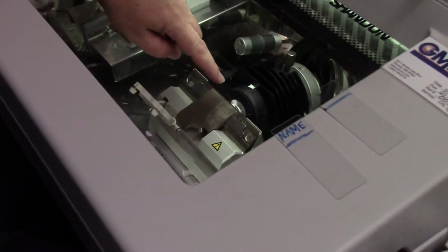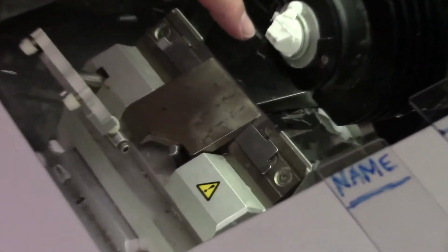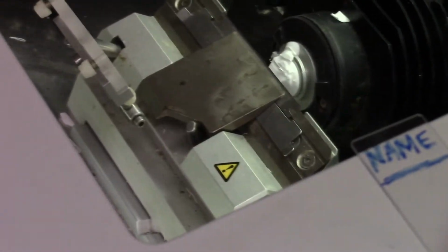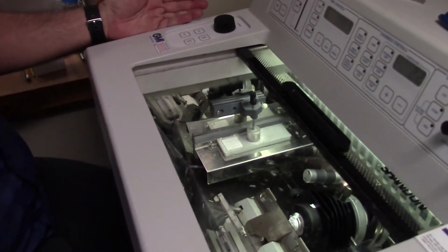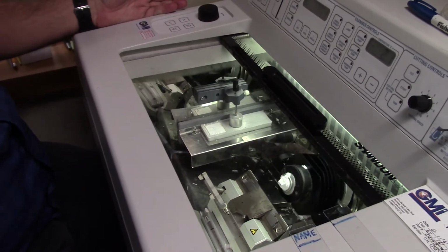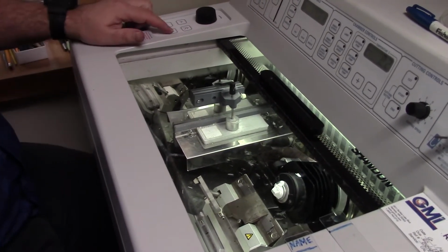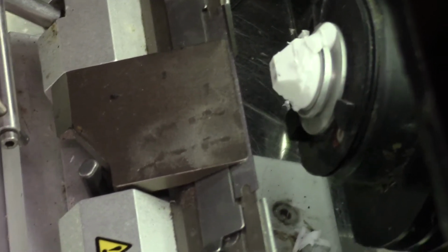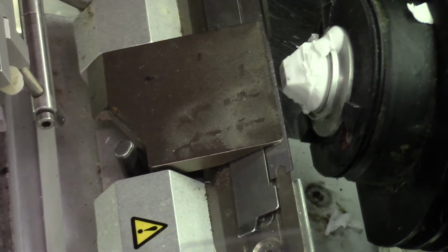But if you watch me right now, notice I'm nowhere close to this tissue hitting the chuck. So luckily over here we have some additional buttons that can move our chuck forward, the chuck holder forward, more than just 20 microns. So if you film real close right here, watch and see if you can see it moving as I press these buttons. Can you see it moving closer towards the blade? Oh, it's getting pretty close.